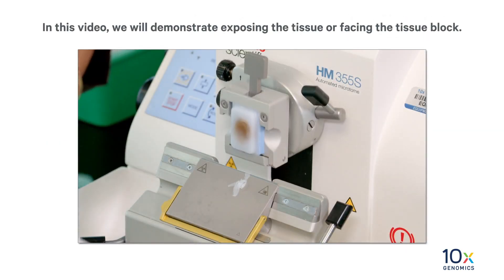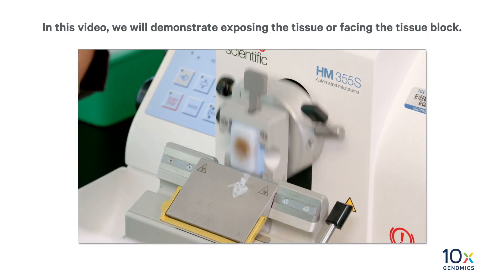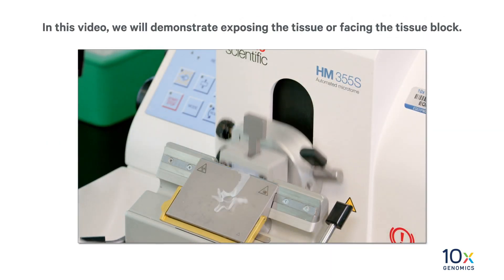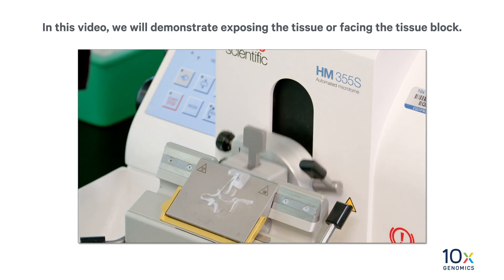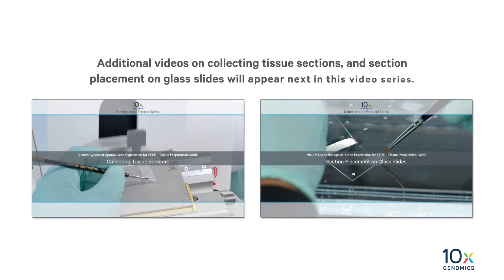In this video, we will demonstrate exposing the tissue, or facing the tissue block. Additional videos on collecting tissue sections and section placement on glass slides will appear next in this video series.